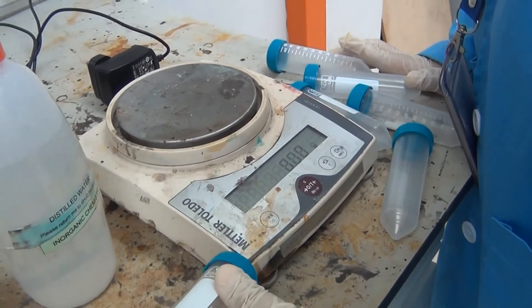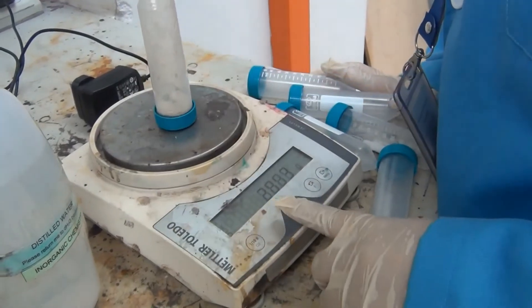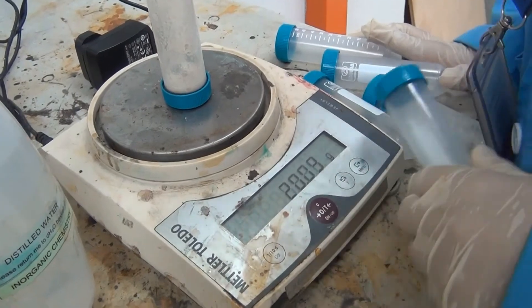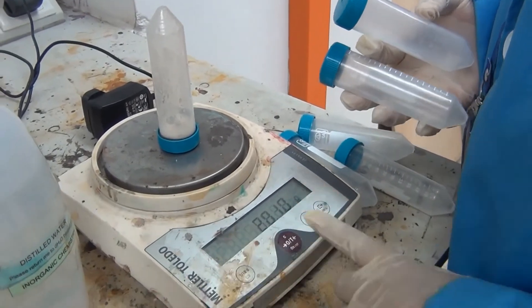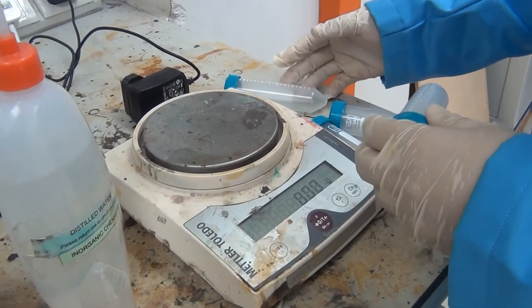Before we centrifuge, we have to wait and then we have to balance all other centrifuge tubes with still water at the same weight. This is 20, and then we put the distilled water.